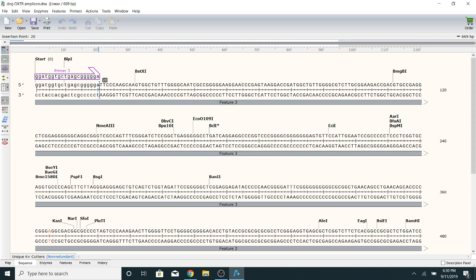So when you're calculating that, it looks at the primer sequence and length. The longer you get it, if I were to bring it out here, it just keeps getting higher and higher and higher, right? And eventually it gets so high that it's just too much and you can't really get PCR to work right. But the general temperature range is basically anywhere from like 50 to 60. This one's a little high because it has a lot of G's in it. But I didn't actually design this primer, I took it from a paper. That's one place you can get primers that you know work, is papers where people have already done the troubleshooting for you.